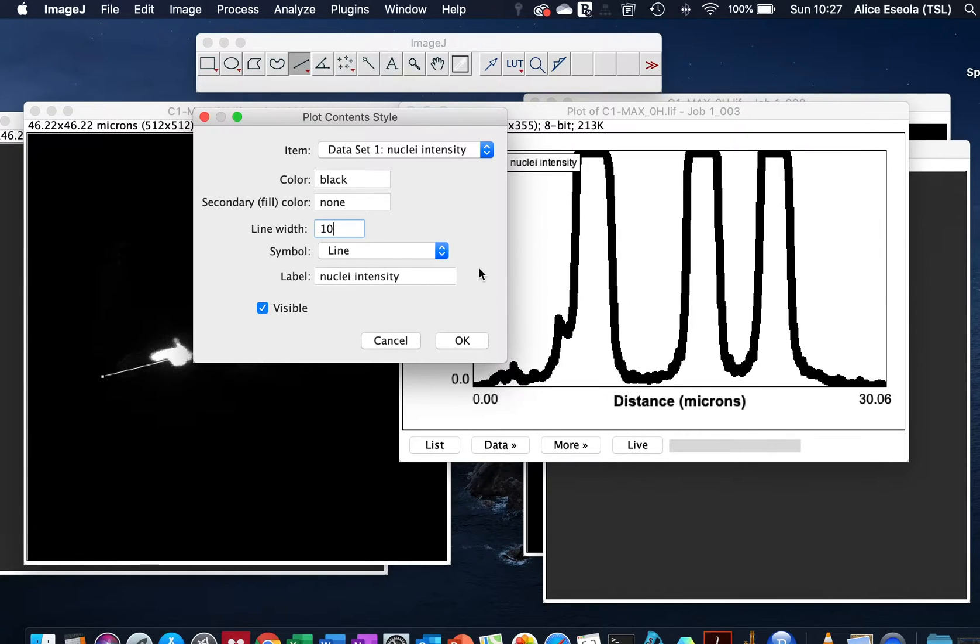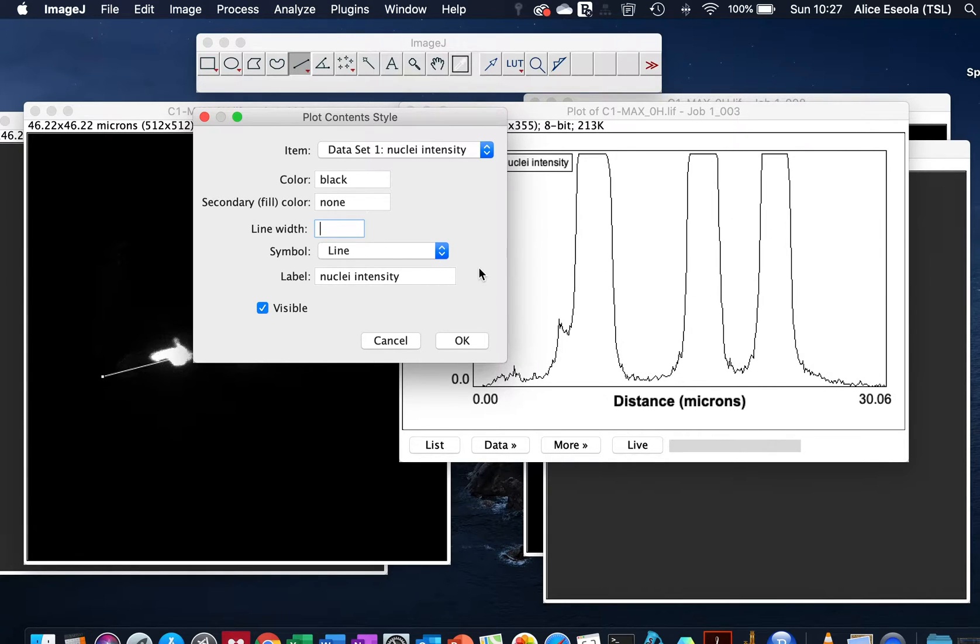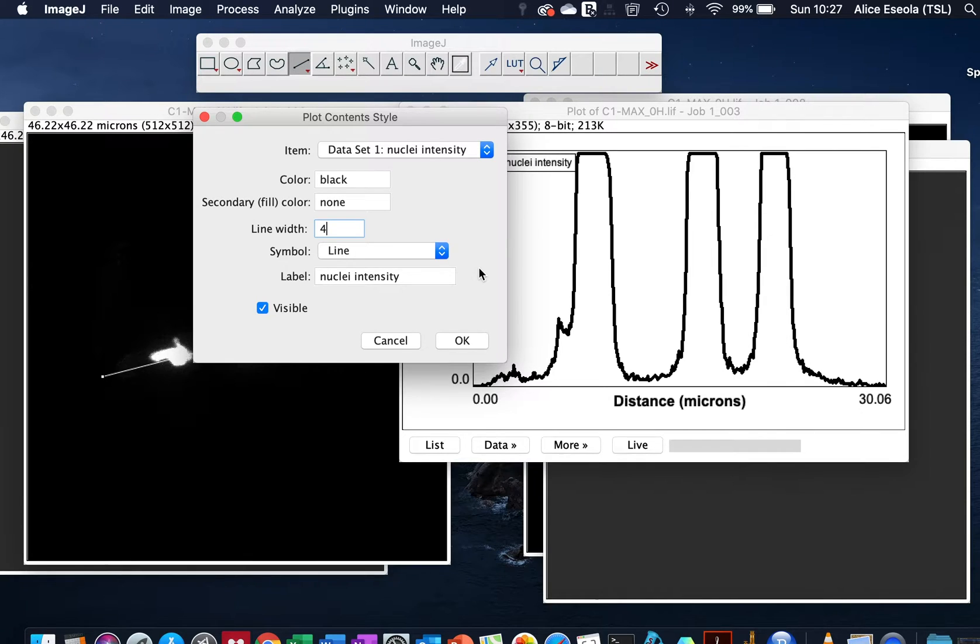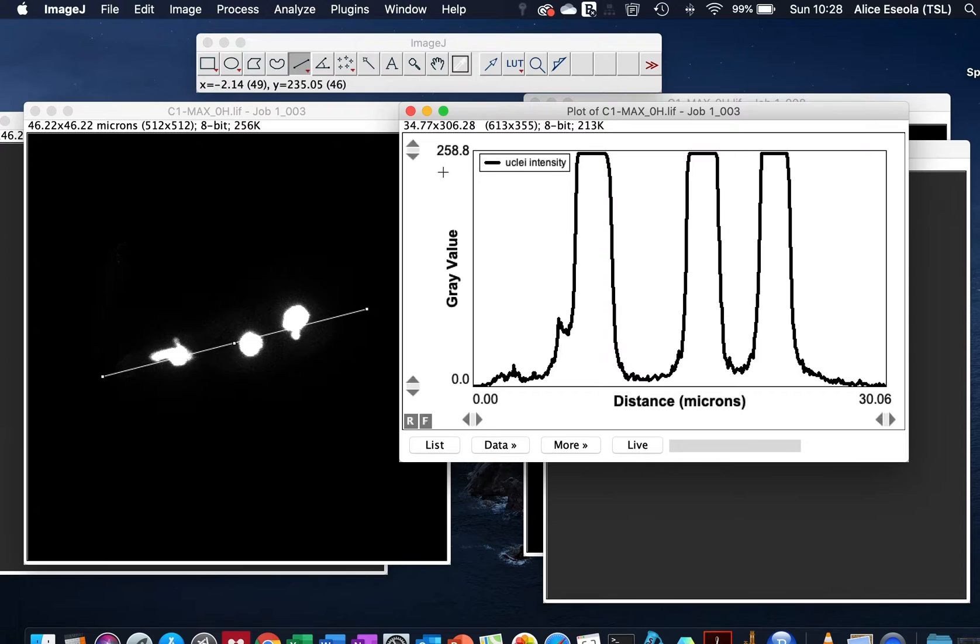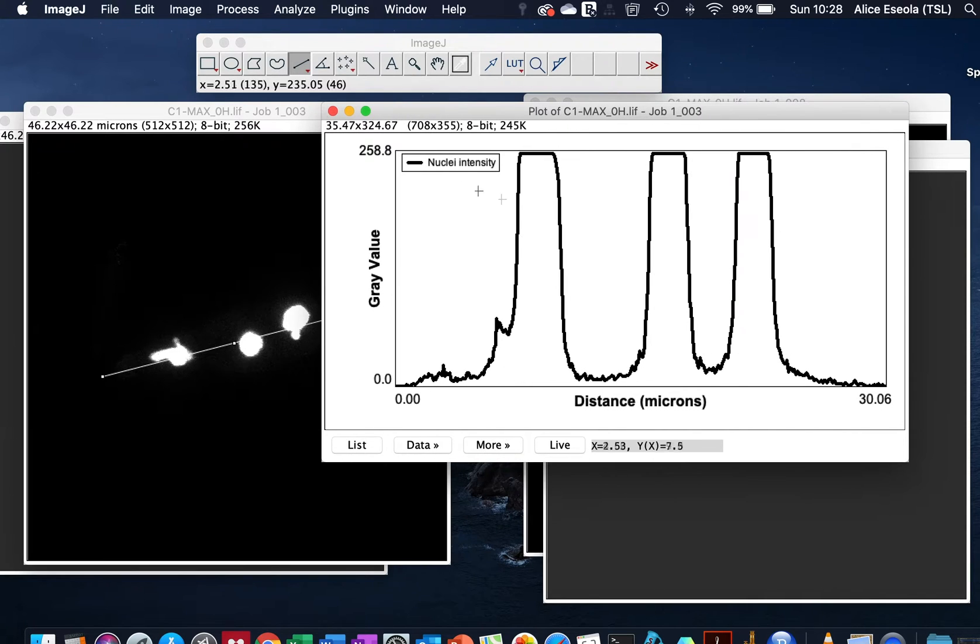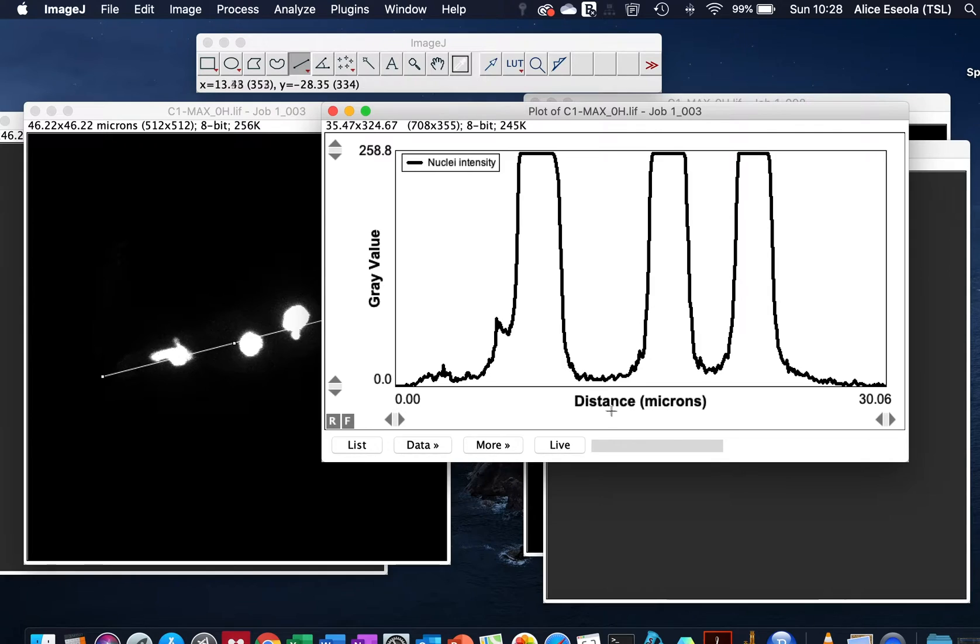So for this purpose of tutorial I will - and our label is still nuclear intensity. We can put this in capitals and there we have Nuclear Intensity and the distance in microns.